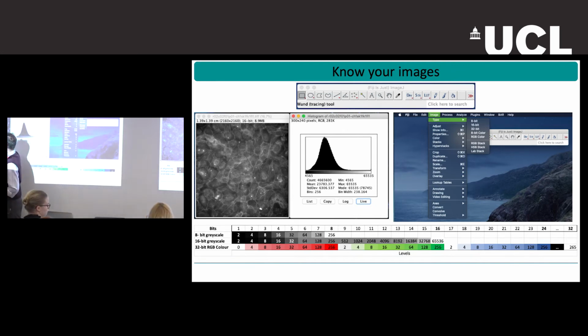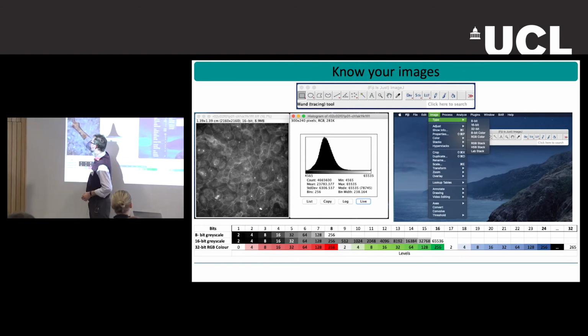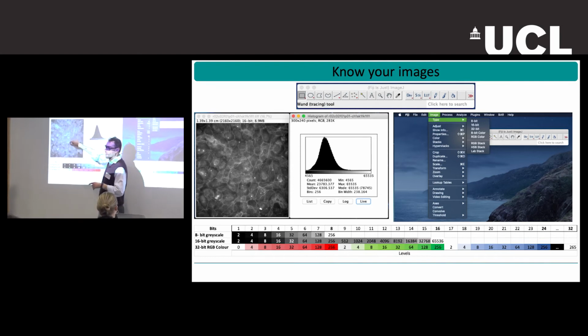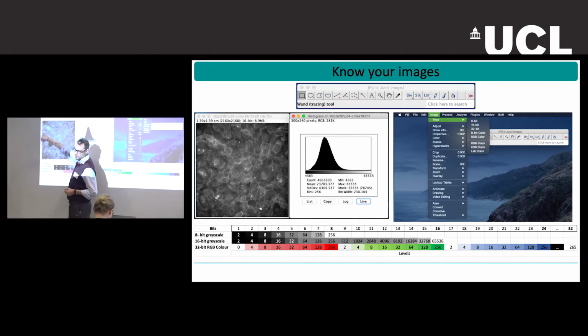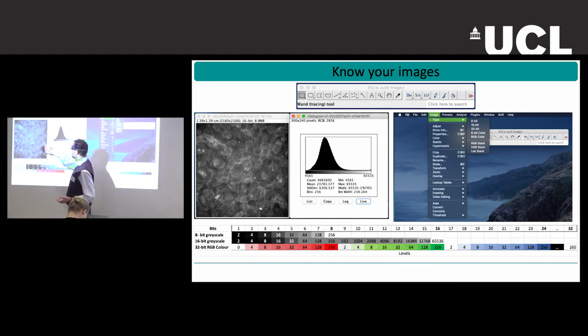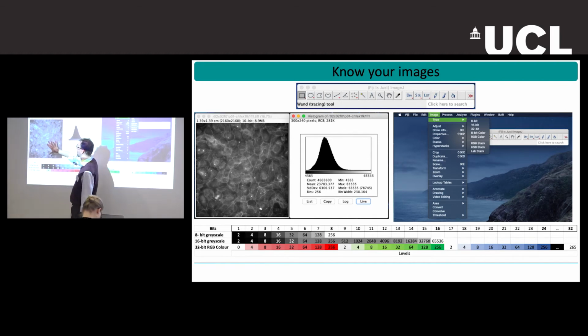And right here I spot an error, an import error, my mistake. I did this yesterday at 6. And it's telling me centimeters. It's just a scaling error, but be aware of this, because if you ask me how big this circle I paint here is, it will tell you centimeters. But this is just a notice. Despite the mistake, this is an image which has certain characteristics. It comes directly from the Operetta, and this is a typical output of an image from the Operetta. It is 2,160 by 2,160, which is quite huge, and it is a 16-bit image.